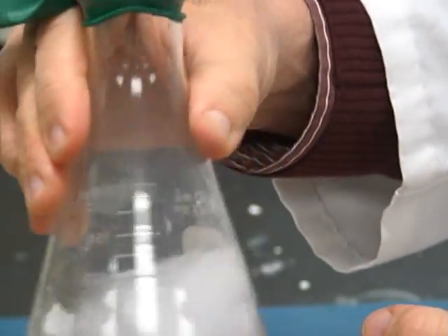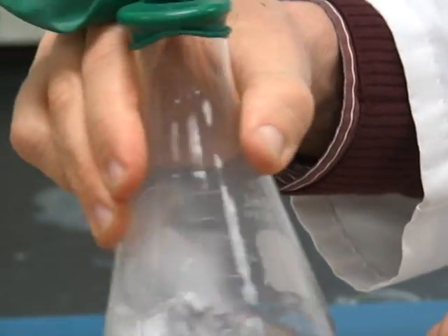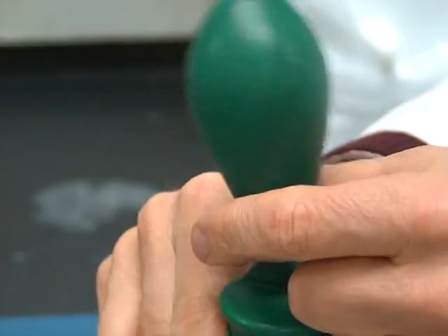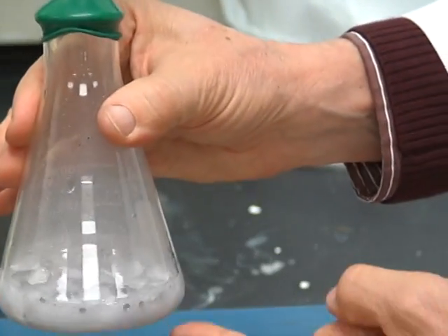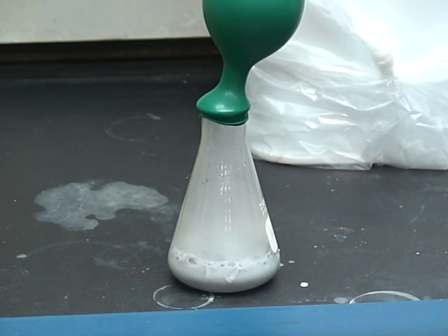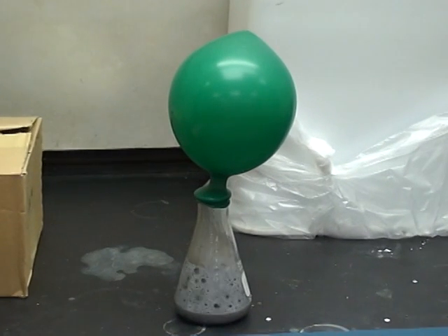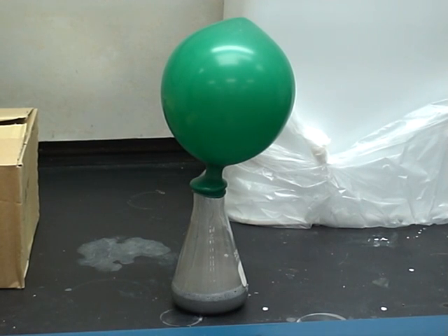There's activation energy going on. It takes some time for this to happen. It's got to overcome the activation energy. You see a lot of bubbles now. And pretty soon I'm going to let go of this. There it goes. Start to see something happening here. Oh, it's getting pretty violent now. See the bubble action? I'm going to put it there so I don't get hurt. Pretty violent reaction. That's probably about 400 degrees, and it happened very quickly.